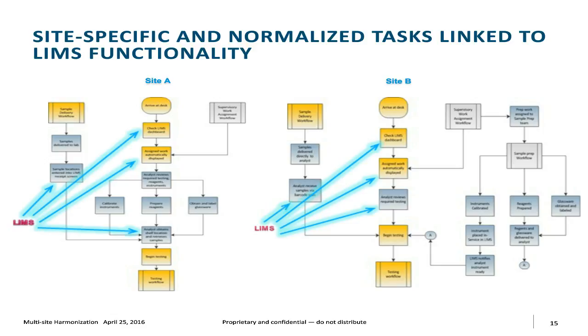If you're in regulated environments, perhaps you're producing products that have sterility requirements, so sterility testing. There's all sorts of labeling of containers to go around to different places, sample and do swabs and those kinds of things and bring them back. There's microbiological testing associated with that. So if you think of all those laboratory groups, you're going to have these kinds of workflows replicated across many different organizations. So while we've taken one small sampling here, what I'm trying to make sure that you look at in your own work is that you're looking into all of these different organizations.